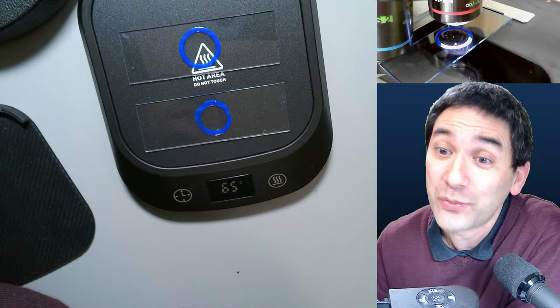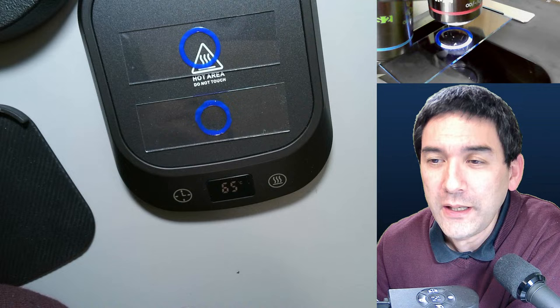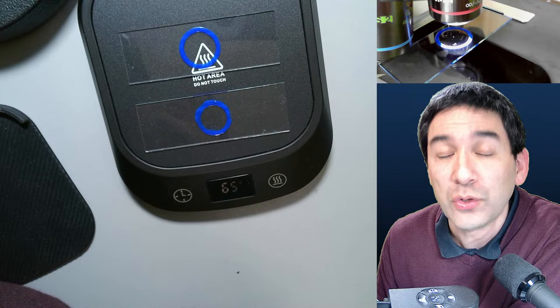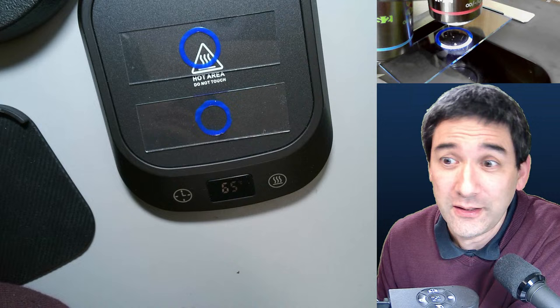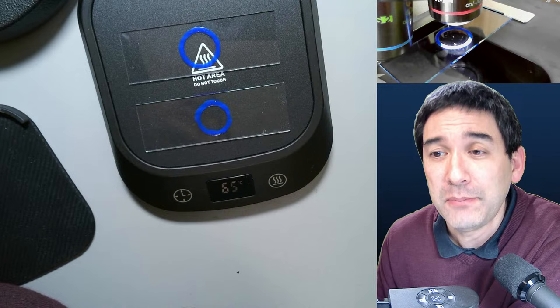Good evening from Poland, Belgium, the UK, the United States, the Netherlands, Rhode Island, Wisconsin. Sound is great, thank you. Hello from Canada. What do you think about the Carson Mini Flip Pocket microscope? I don't think I know it, but I suppose it's one of those tiny pocket microscopes you can take along. I'm thinking about making reviews of these tiny microscopes. My general suggestion: try it out and see if it proves useful.